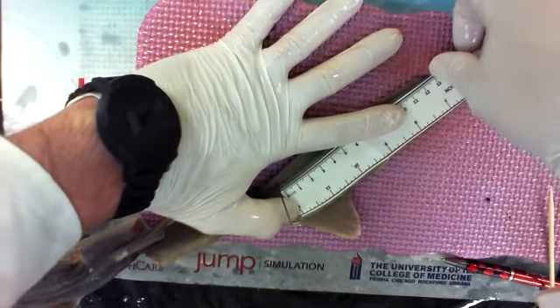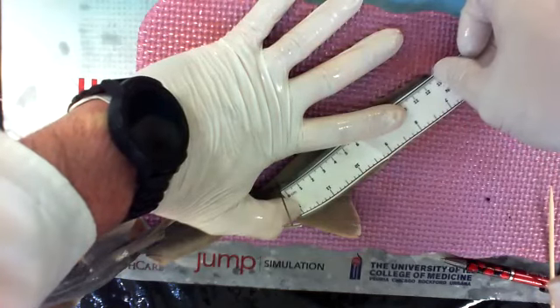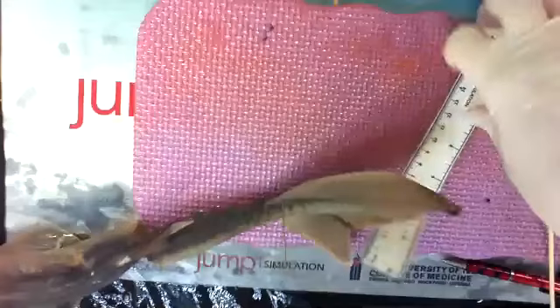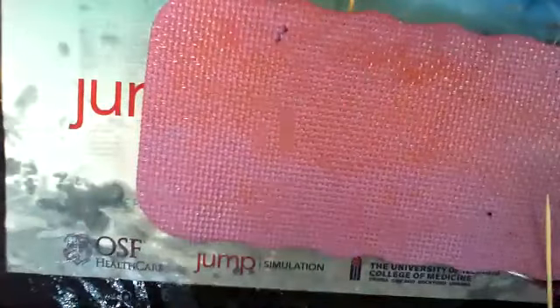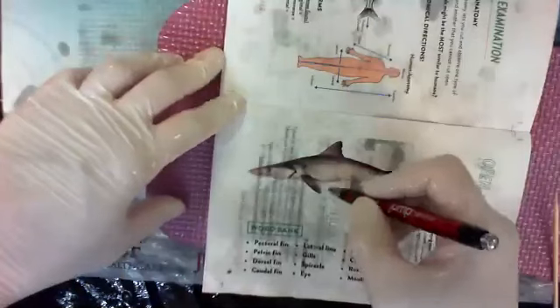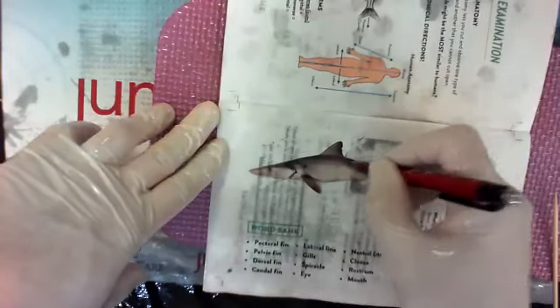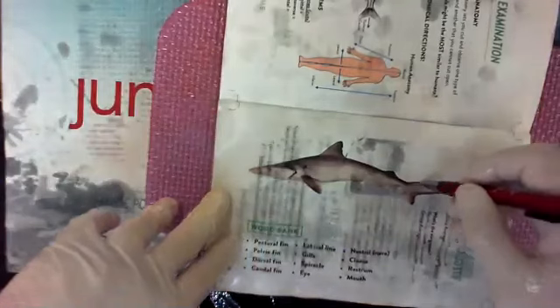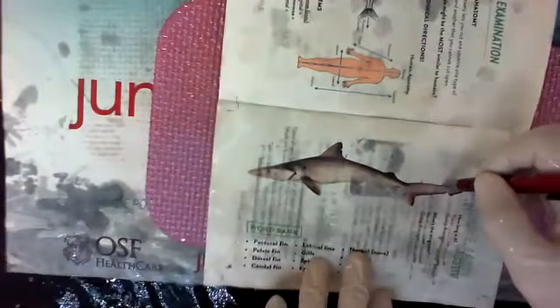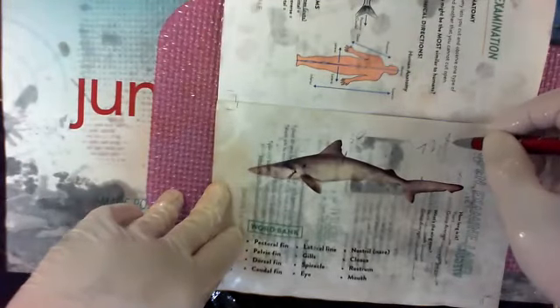Wow, that looks like 12.8. We're going with 12.8. All right. It asked me how long is it. So I've got, wow, this book got drenched pretty fast. See the back of the fin, it's about 30. Yikes. From here to this is about another 30, and then 12.8. So I've got 72.8 centimeters.